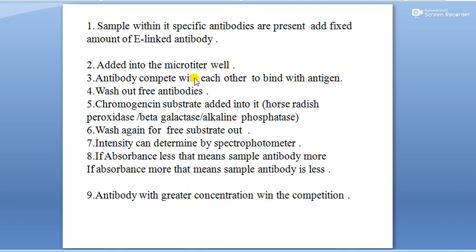The sample antibody cannot bind with the substrate, so it cannot produce the colored substance. That's why we can say if absorbance is less, that means the sample antibody is more. Less color means more sample antibody.